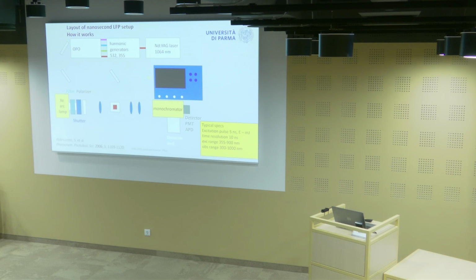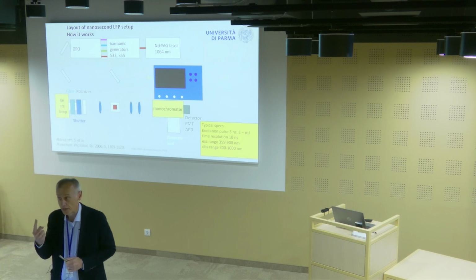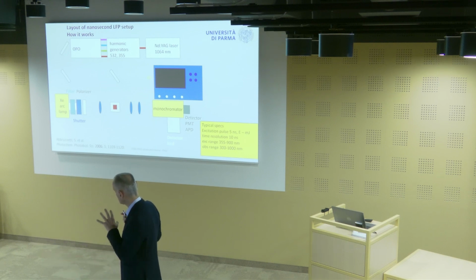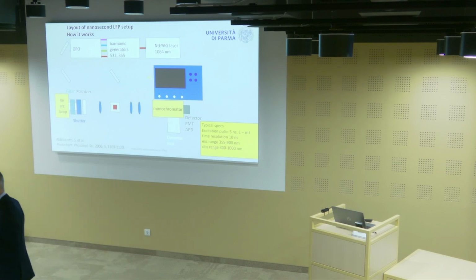And then you have a detection line. You may have several methodologies. I'm showing you one because it's flexible. But keep in mind that there is another one, which I will comment on later, which is similar but substantially different. So you have a xenon lamp. Xenon lamps are important to be used. Don't use any other type of lamps because they are too weak. Plus, they have a major advantage, xenon lamps. They emit through an arc. They ionize the gas. And what happens is that the arc is tiny. So it's very efficient decoupling with the monochromator.